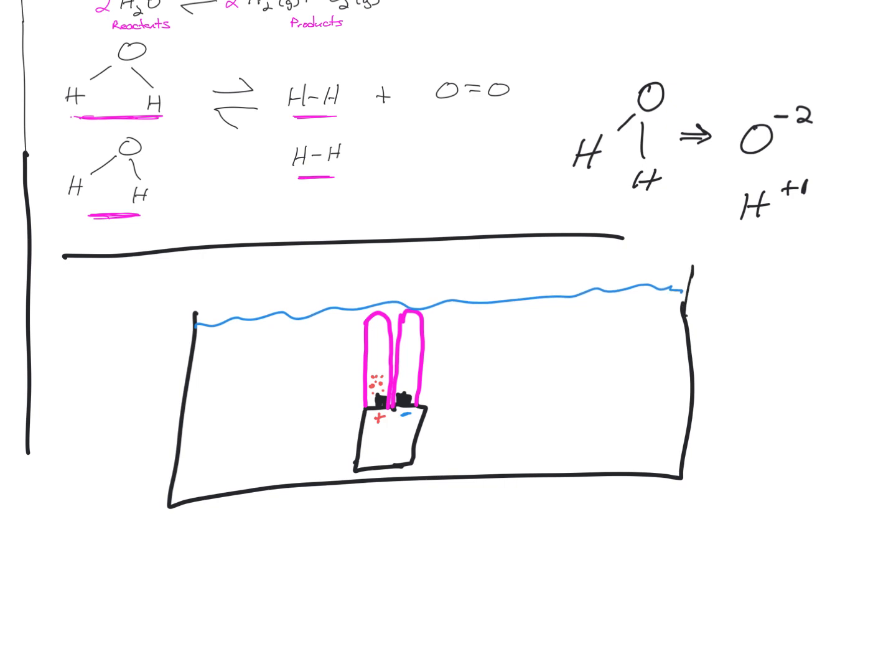Not going to dissolve. As the gas comes in here and goes up to the top, what's going to happen to the water? It's going to be pushed down, because of air pressure, because the gas is pushing down on the water. Does that make sense? So the water level in the test tube is going to come down. Let's say it comes down to here. Okay?